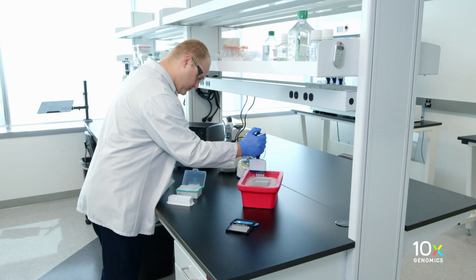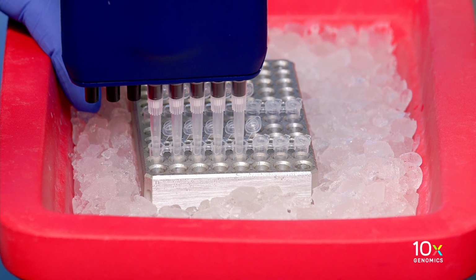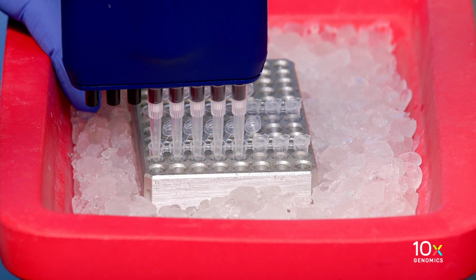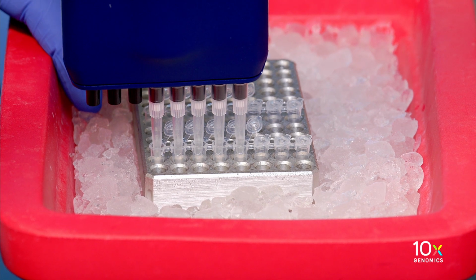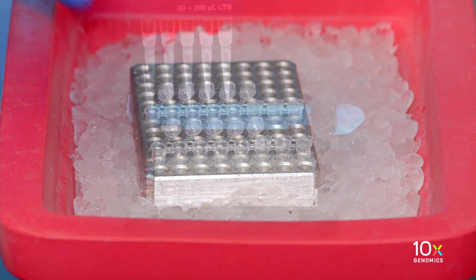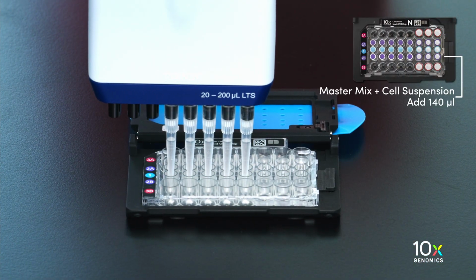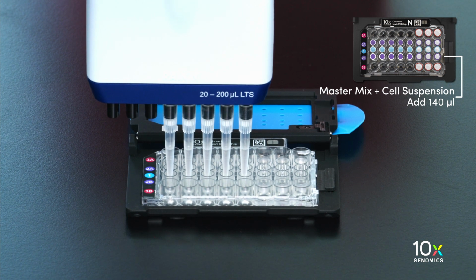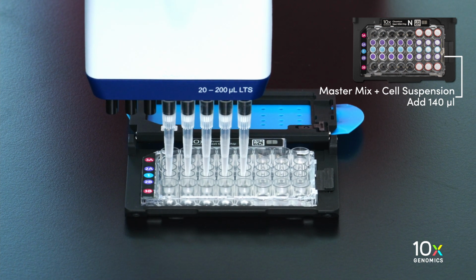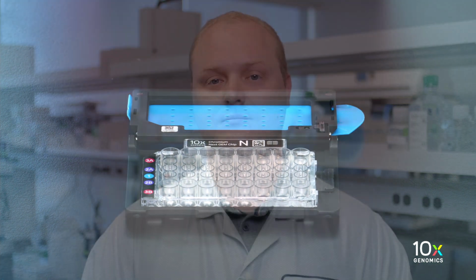Next, we will process the remaining 5 samples. We gently pipette mix the master mix and cell suspension using a multi-channel pipette. Using the same pipette tips, we dispense 140 microliters into the bottom center of the wells in the row labeled 2B. Wait 30 seconds. Finally, we will add the partitioning oil.